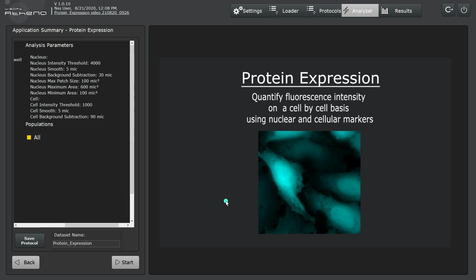and the last thing we need to do is set the name of our dataset. Optionally, it can be defined on the Analysis Setup menu within the Dataset Info button, or we can adjust it here. The name of this dataset, similar to those for Hermes, cannot be changed once they are defined and after analysis is performed. For this tutorial, I will leave the name as it is currently described and simply begin the analysis by clicking Start.